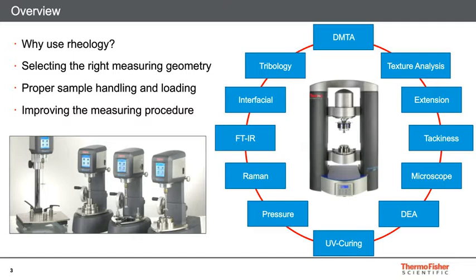And before you do a rheological measurement, it's crucial that you select the right measuring geometry or tool, rotor, spindle, for the actual material and the job you want to perform. Then we'll move from the selection of the geometry to actually handling the sample properly and loading it into the rheometer. And then from there, we'll discuss how you can improve the measuring procedure itself.